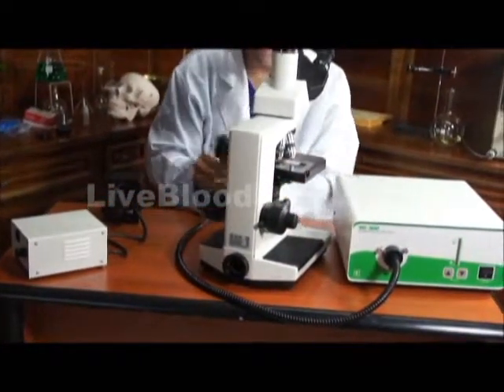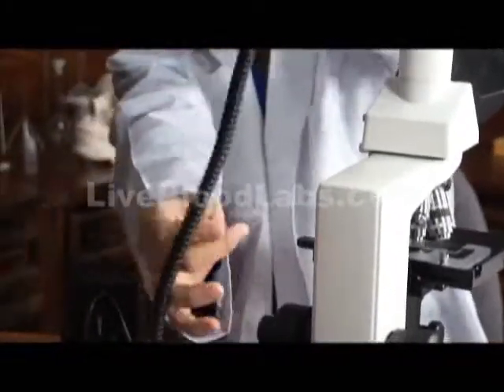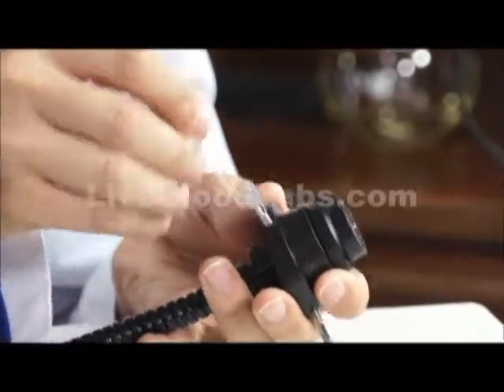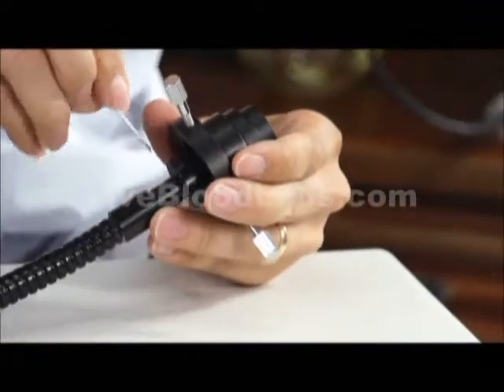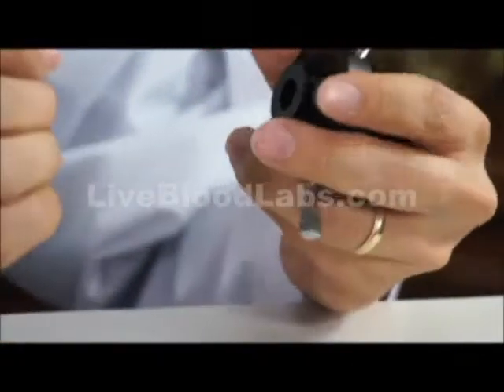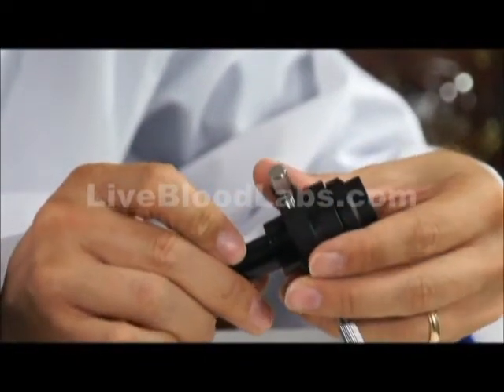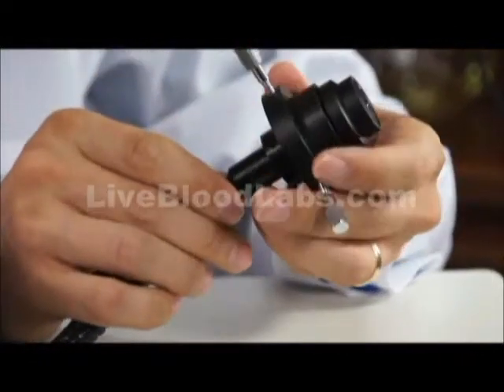I'm going to take out the dark field condenser. This is what I was talking about earlier — how you can adjust how far in this goes. It's rather tight; I need to loosen it a little bit more. You could push it all the way in and try it, but you may get a better image pulled back just a little bit. Most likely just leave it all the way in, but that's something that can be adjusted.